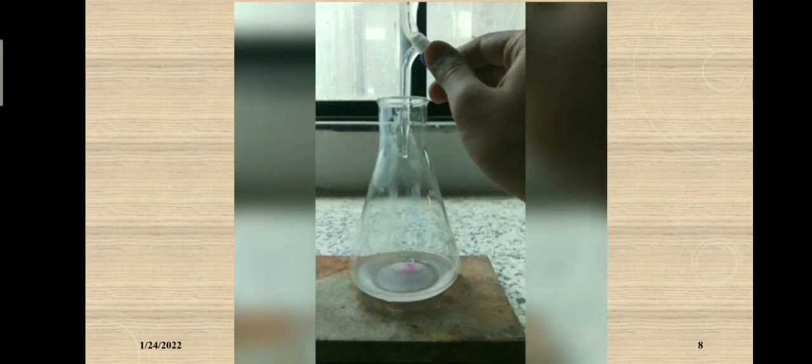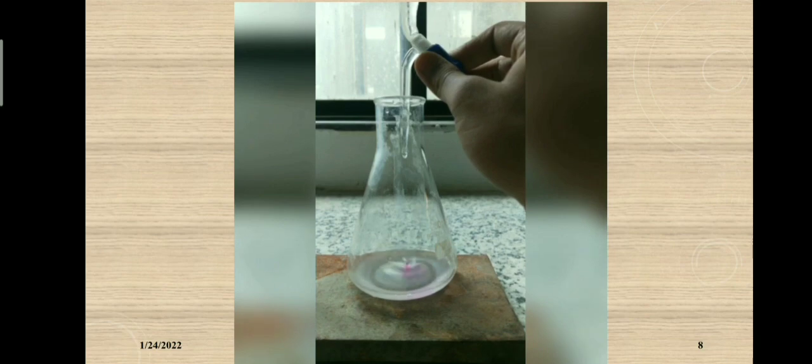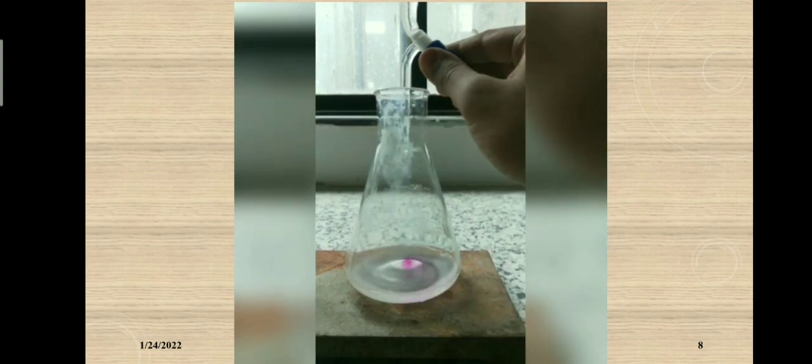Now you can see that the color was pink after addition of the drop. The end point of the titration is detected by the production of a pink or violet-pink color. Here we can see that the pink color formed but disappeared after 2 to 3 seconds. This process continues up to the end point detection, until the pink color finally persists in the conical flask.